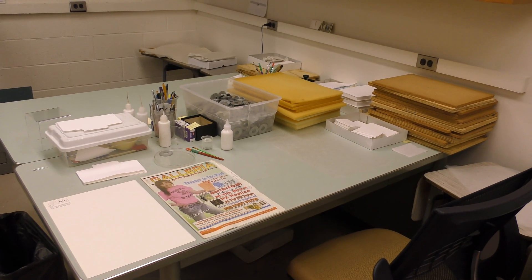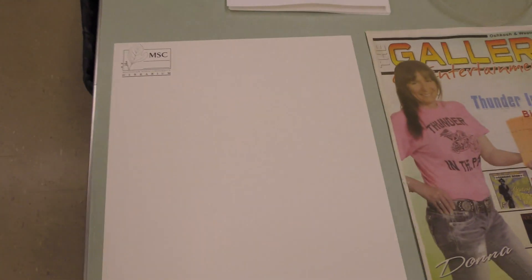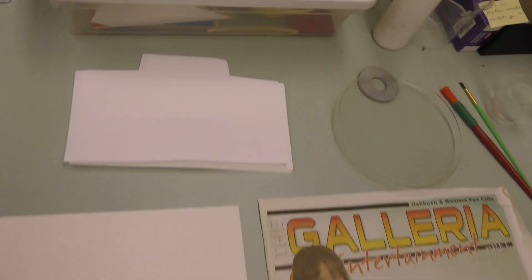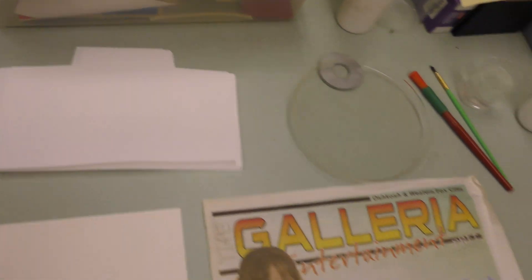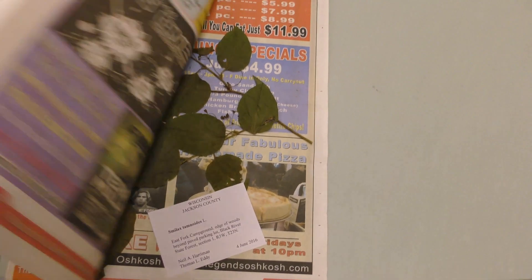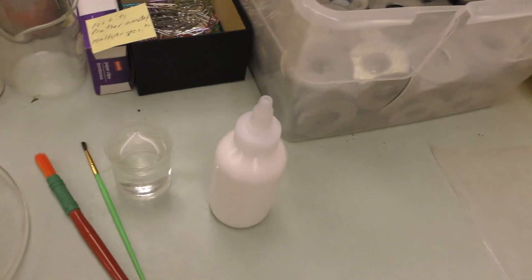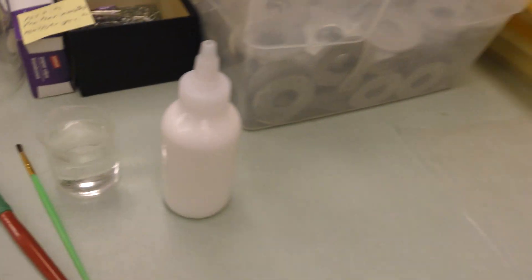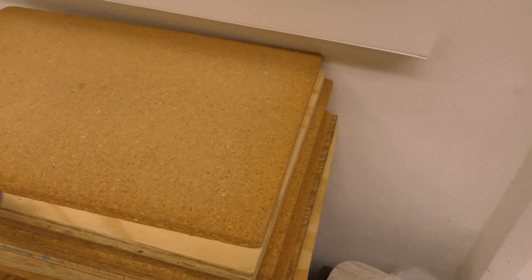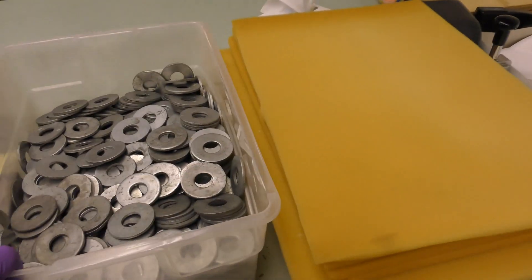This is our mounting station and some of the supplies I've got ready include acid-free paper to mount the specimens on, fragment packets, the unmounted specimen — you can see that's in here with a label — a place to dilute glue, paintbrushes, a little bit of water, a glue bottle, wax paper, boards (you can use books if you don't have something like this), soft foam pads, and washers.